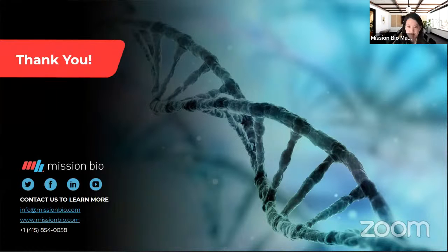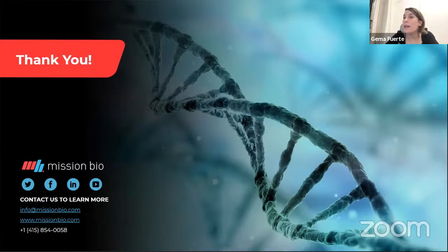Got it. This is an interesting question. Do you provide bioinformatics support for these analysis tools? For people who don't have a lot of bioinformatic resource, where do they start? Sure, we provide training for all of our customers. We will have a session similar to the one we had today, where we take them through the software. There are a lot of documents available on the website, as well as videos and follow-up sessions to help people familiarize with the software, regardless of their bioinformatics skills.